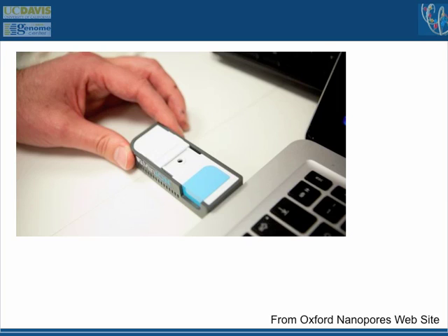I'm a field microbiologist. I mean, if I could take this out on a deep sea research cruise or up into the Sierras or whatever, I don't know. What they didn't announce, and what I've asked them and still haven't found out, is what you feed into this. Like, who cares if you can have a thumb drive sequencer if you need 70 ultracentrifuges to prep the DNA?